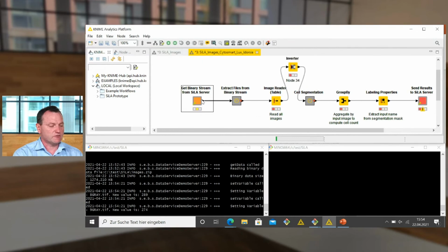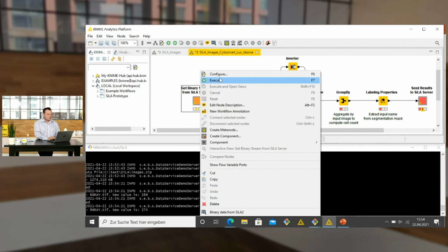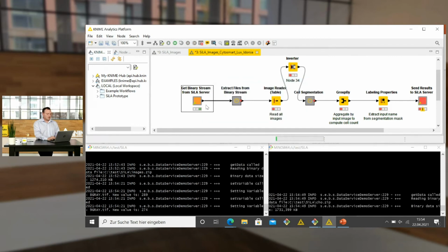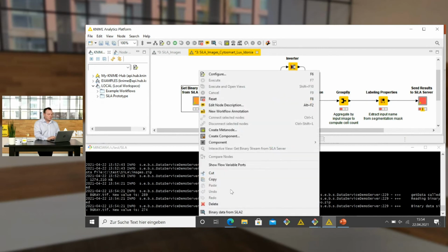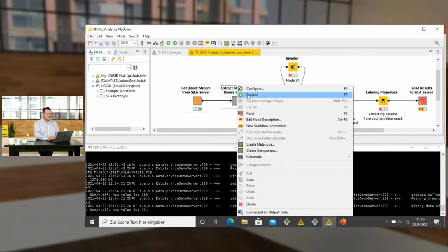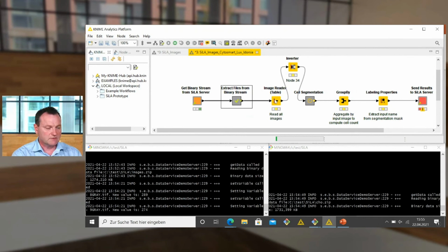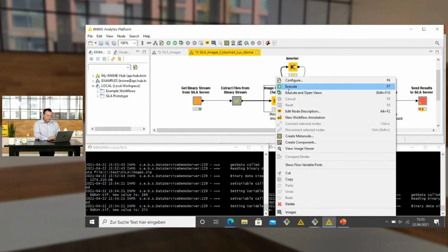I have also received some other pictures directly from a cell culture lab, because I have noticed the pictures that you saw will not directly come from a cell flask. So some friends from Edosia gave us some pictures directly from a microscope, which is integrated into an incubator. It's a CytoSmart system. And the idea is to continuously monitor the cells in the incubator, to start the process when the cells are ready and not when the robot is ready. So let's have a look at the pictures.